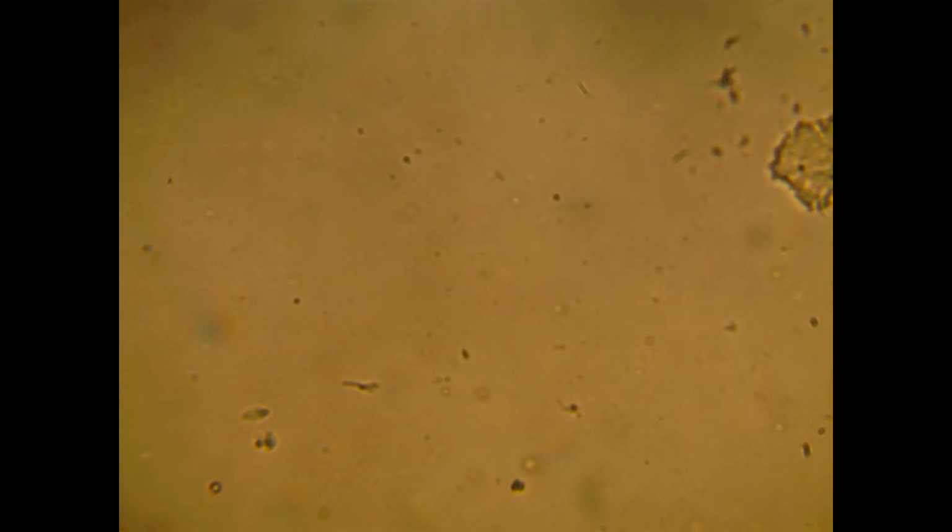This gives you an idea of how rich that compost is in bacteria, and this is what it's supposed to do. Now, in hot compost, when you're making compost outside where you're heating it up, it's turning to 130, 140 degrees. You've got to turn it so you can aerate it so it doesn't get too hot and cook the bacteria and fungi and all these other things that are happening in there. But that's what you want. You are growing bacteria that way.